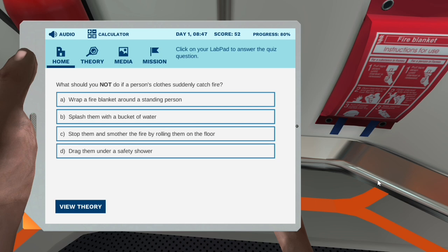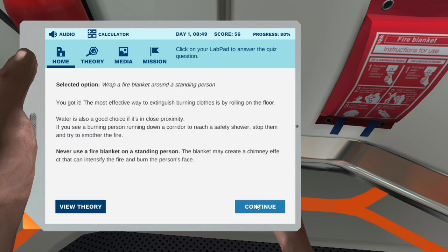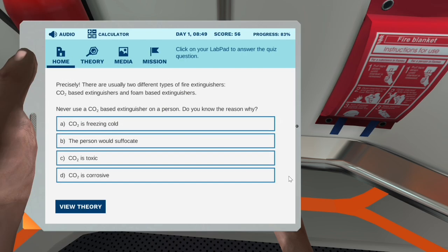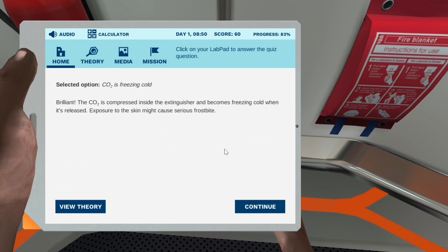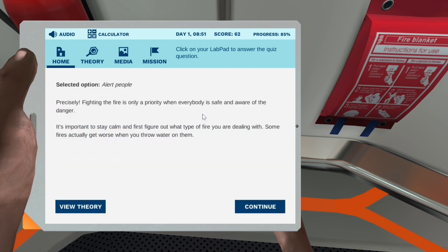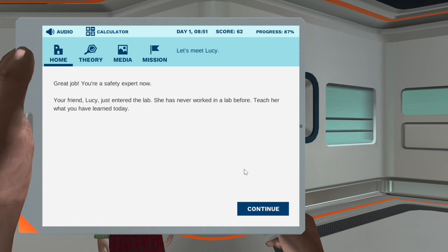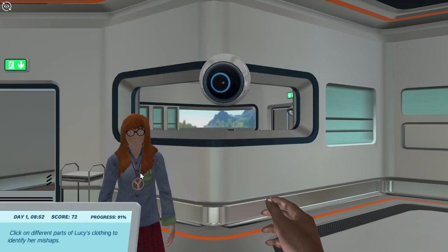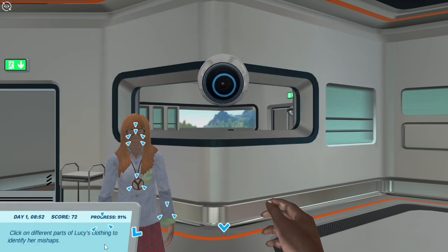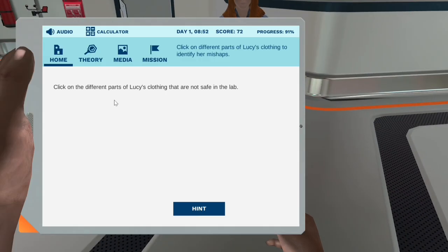What should you not do if a person's clothes suddenly catch fire? The most effective way to extinguish a fire on clothing is to stop, drop, and roll. What would you use if there was an open fire in the lab? Precisely — there are usually two different types of fire extinguishers: carbon dioxide based extinguishers and foam based extinguishers. Never use a carbon dioxide extinguisher on a person.